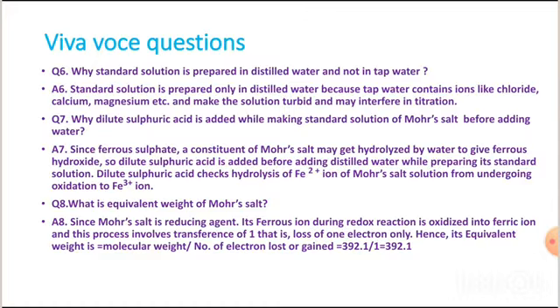Next question is, why is standard solution prepared in distilled water and not in tap water? The answer is, standard solution is prepared only in distilled water because tap water contains ions like chloride, calcium, magnesium, etc. and makes the solution turbid and may interfere in titration.